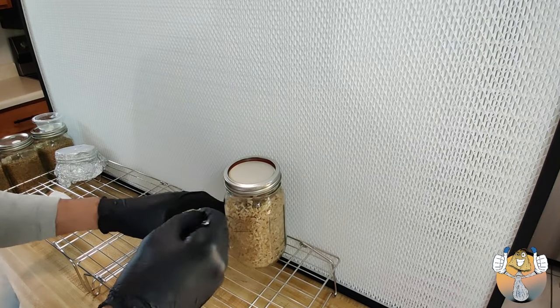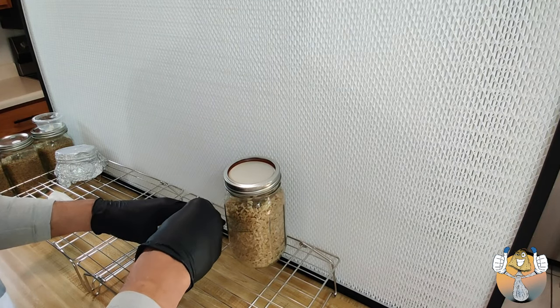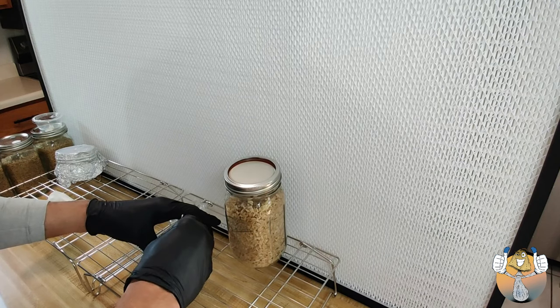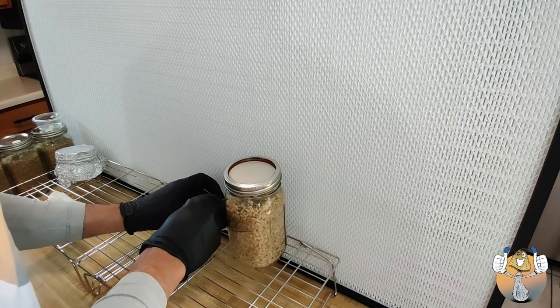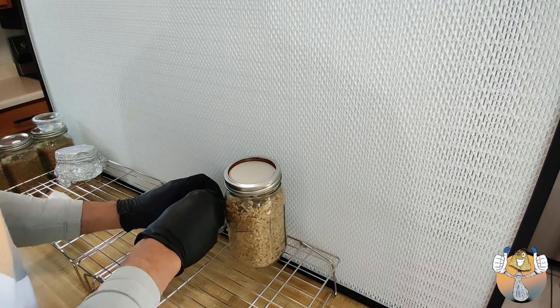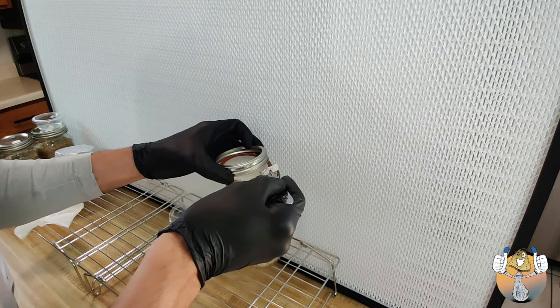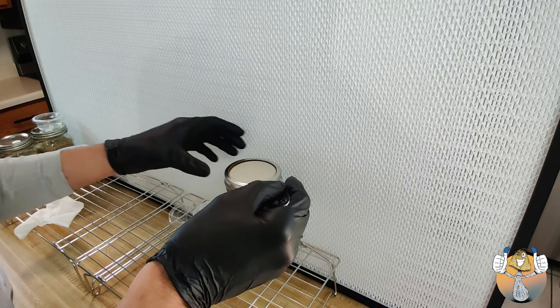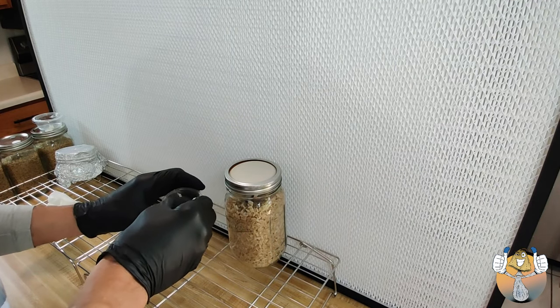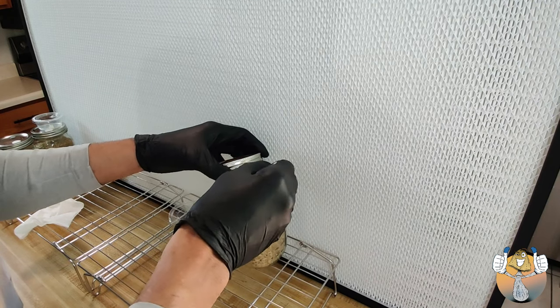I'm going to be honest with you. Working in front of the flow hood is so relieving. A beautiful feeling. The still air box is cramped. It takes way more time to do what you need to do, believe it or not, even though you can just think, hey, it's a still air box, you pack and go. No, this is beautiful. I feel free.